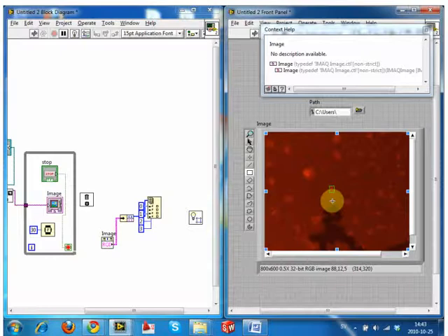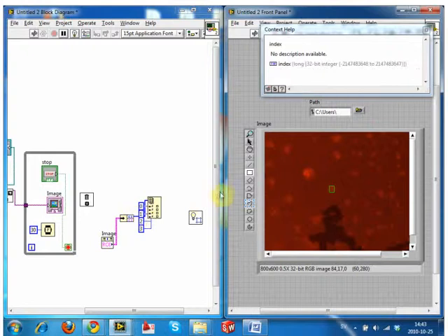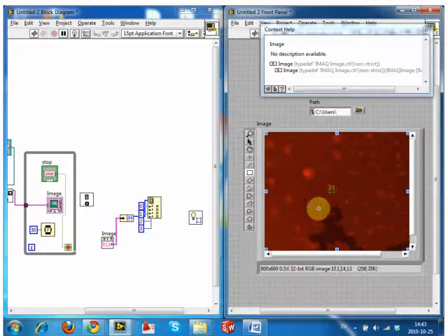Okay. So what are those indexes like? It's indexes for a rectangle. You need 2 data points for a rectangle, top left and bottom right. I'll tell you exactly how it's formatted: it goes x1, y1, x2, y2. So as I pull out this first one, it's telling me the x value of this corner. The next index, index 1, is the y value of that corner, and then this one is the x value and then the y value. Once I know these values, I now know where this rectangle is.